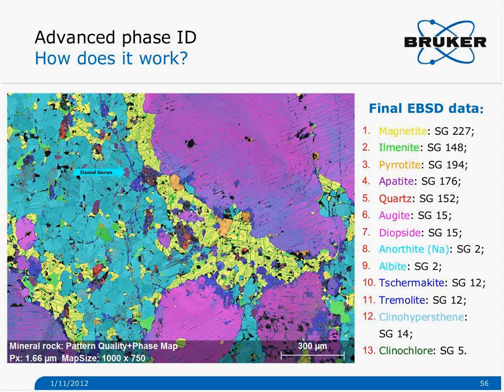So it's a very, very big change in size. And now, of course, if you want to keep the patterns, you can keep the patterns. You basically don't need the patterns, but maybe to be sure, when you do the phase ID, that the solution you find, the phase you find, really fits the pattern, but it's not a must.